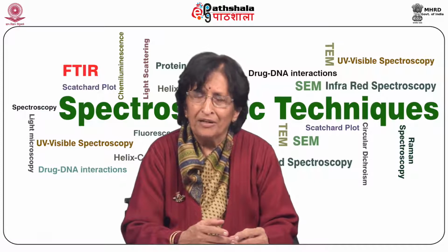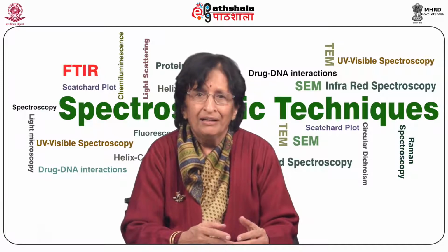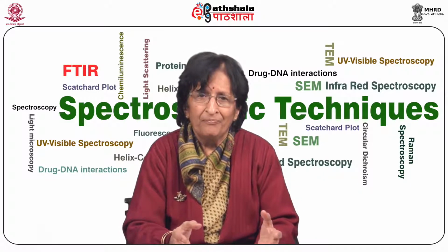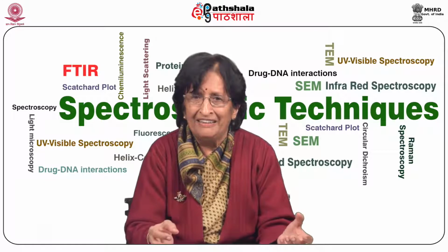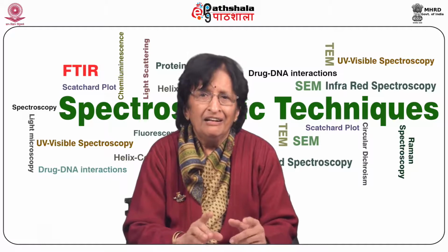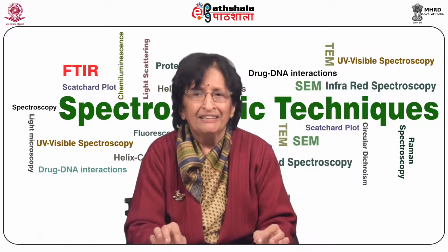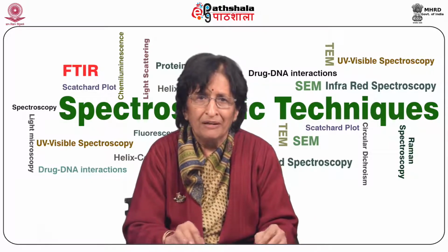Absorption spectroscopy of nucleic acids, DNA and RNA is a very, very useful tool in molecular biology because anything in molecular biology is so much dependent on DNA and RNA and their concentration. The most important thing is the simplicity of the experimental setup needed for measurement of absorption and possibility of reliable estimation of concentration and purity of DNA and RNA, which is a prerequisite for many studies, and that can be done just using UV spectroscopy.